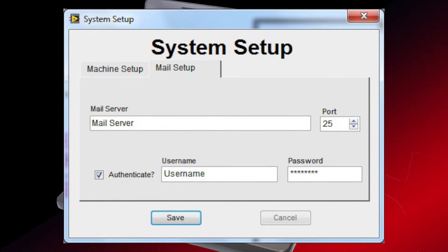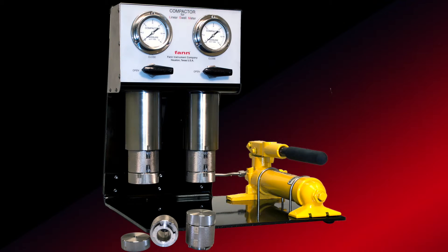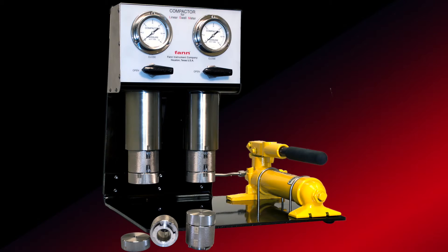The maximum operating temperature for the LSM is 180 degrees Fahrenheit, 82 degrees Celsius. The Linear Swell Meter 2100 comes with control software, a four-measuring head unit, and a two-cell hydraulic compactor for creating shale core plugs for testing. The compactor will apply approximately 10,000 pounds per square inch constant pressure.